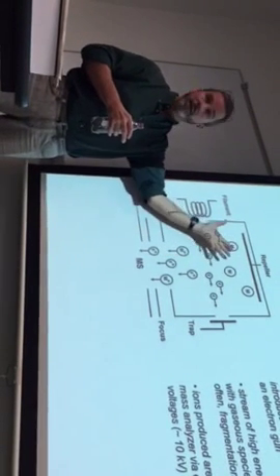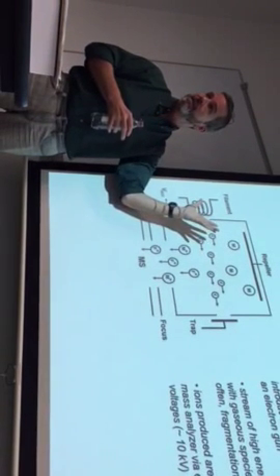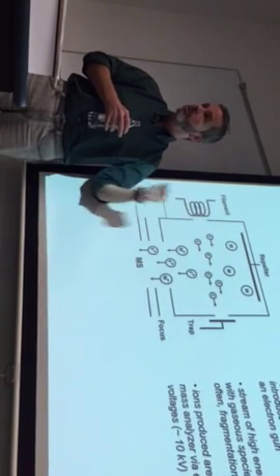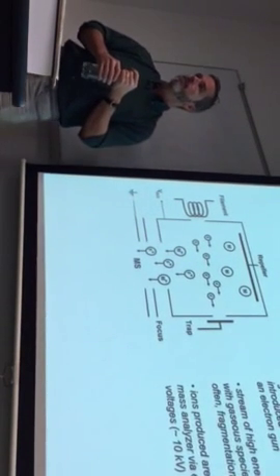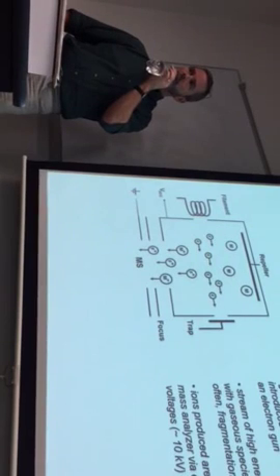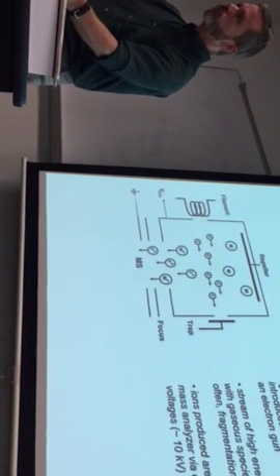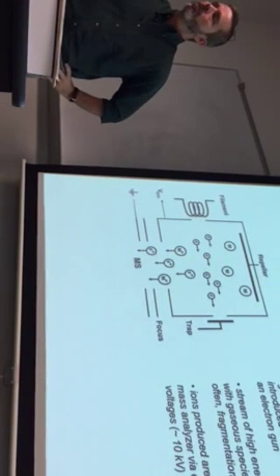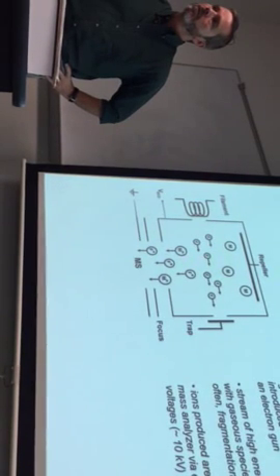But basically, you've got gas phase molecules in the same region of space as these high energy electrons. So they'll diffuse around and encounter that high energy electron beam and become ionized. So why are the electrons stripping an electron from the molecule? That's what I'm not understanding. Is it the energy of the electron stream, bumping the electron off of the molecule?